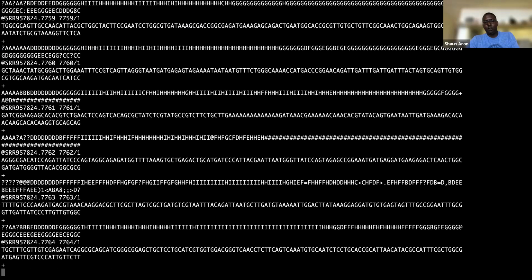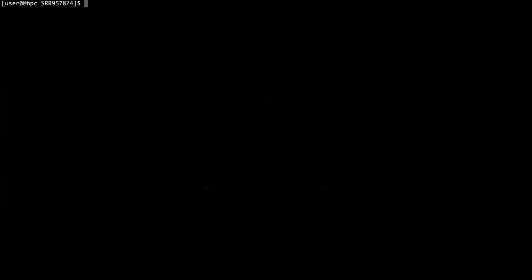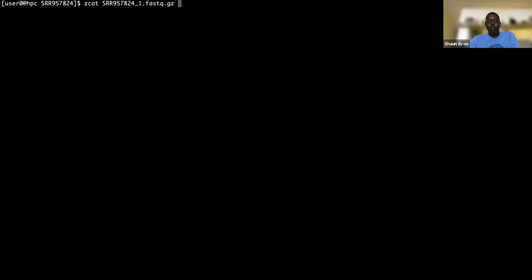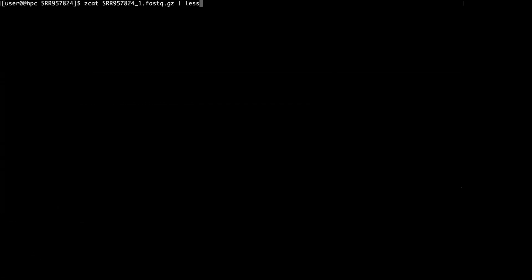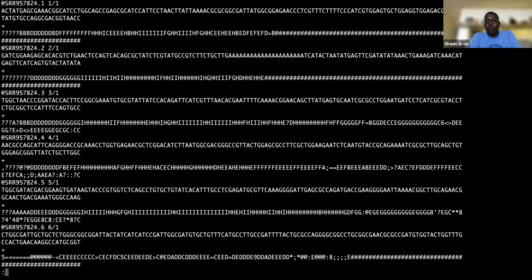Oops, sorry, mistake. Okay, so if I want to have a look at what's in this file, I can use zcat, and then I can just pipe it to less.